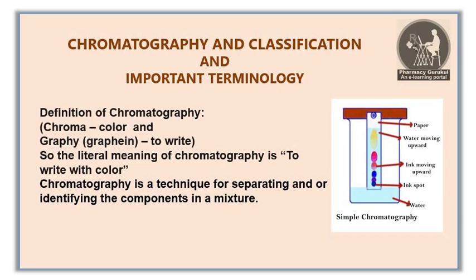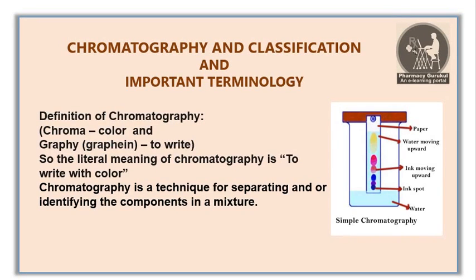Do you know how it got its name as chromatography? Let's go back to history about chromatography. Chromatography was first developed by the Russian botanist Mikhail Tswett in 1903. He produced a colorful separation of plant pigments known as chlorophyll. So this way, this process is known as chromatography. Although color no longer plays a role in this process, the same principles of chromatography are still used and applied for the separation and identification of compounds.